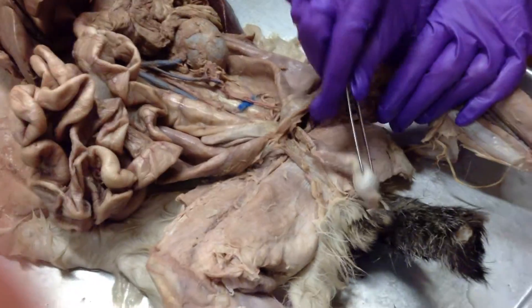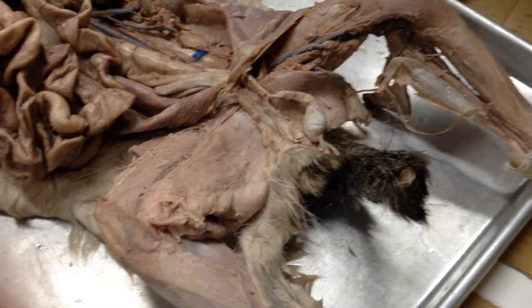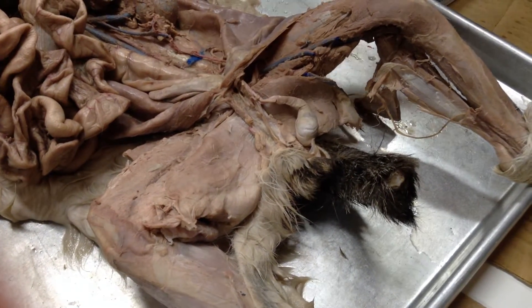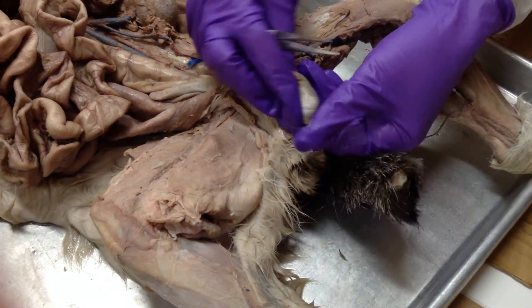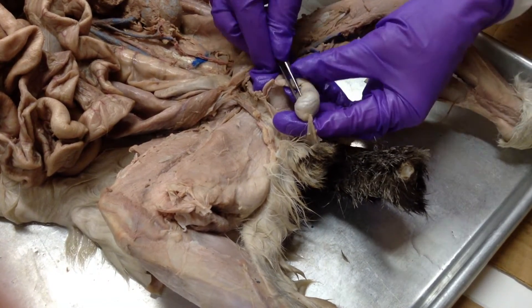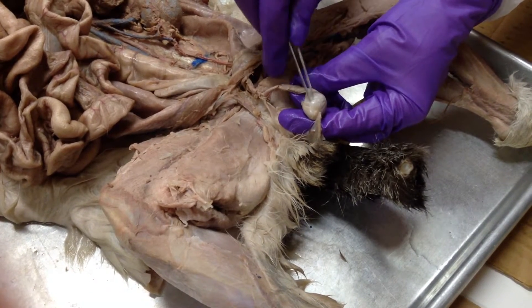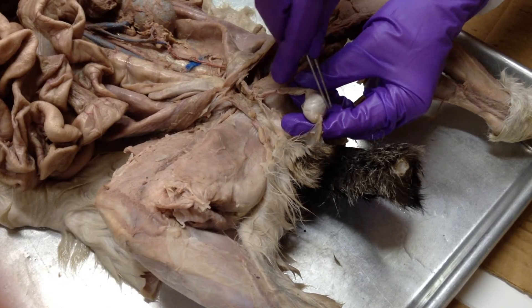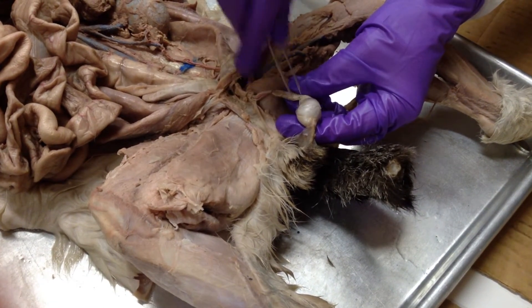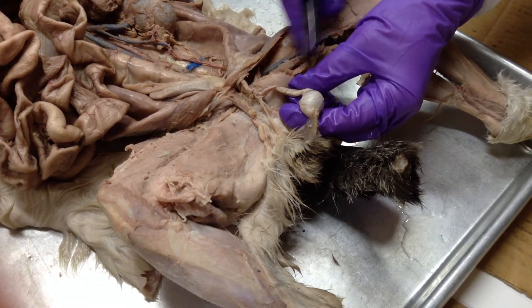The inside of the ball is the testes, but it has the epididymis, which is kind of like the thicker outer part. When you cut it open there's a thicker part — that's the epididymis. The actual inside part is the testes. The epididymis is easier to identify from the outside because it's technically the outer part.